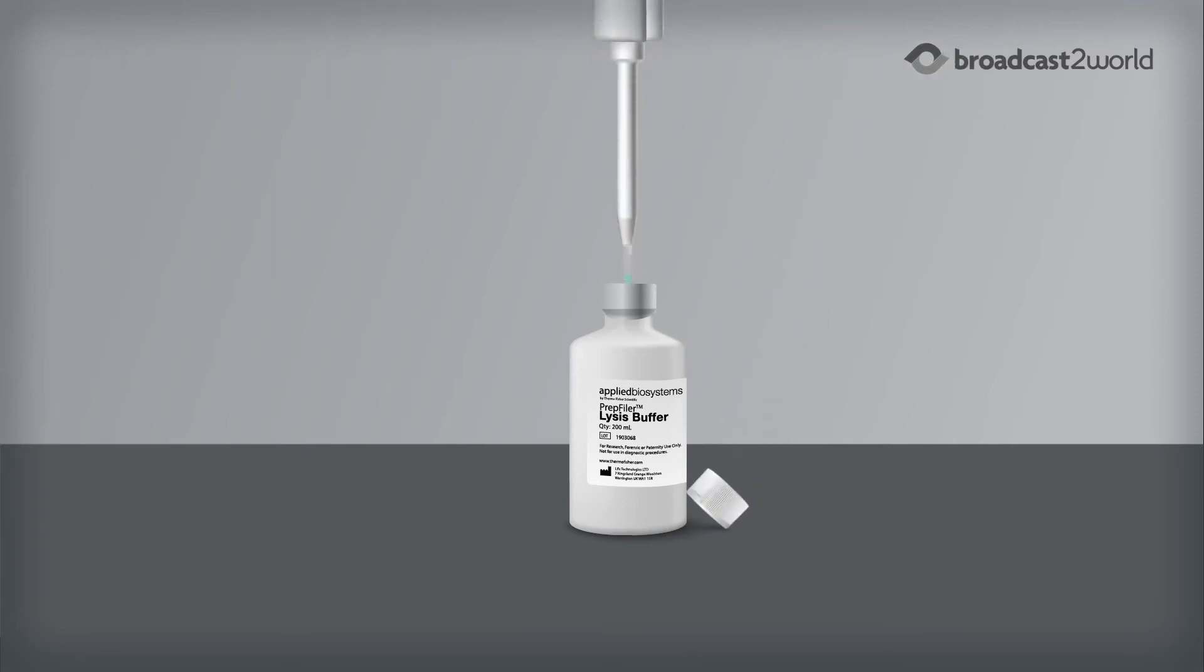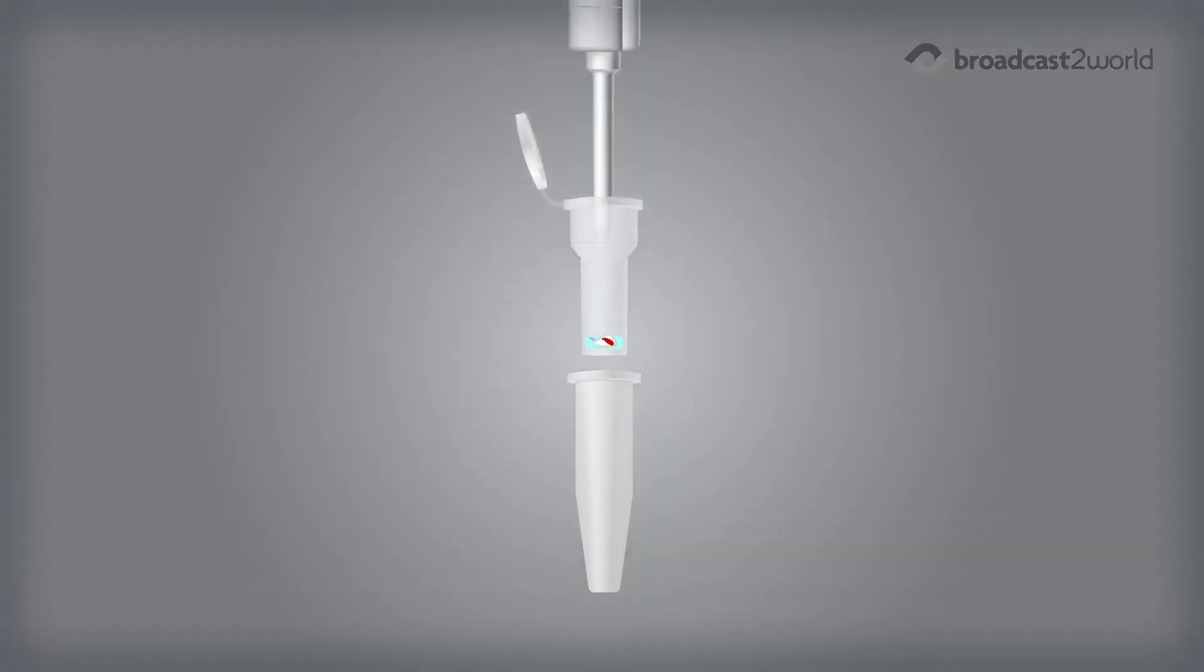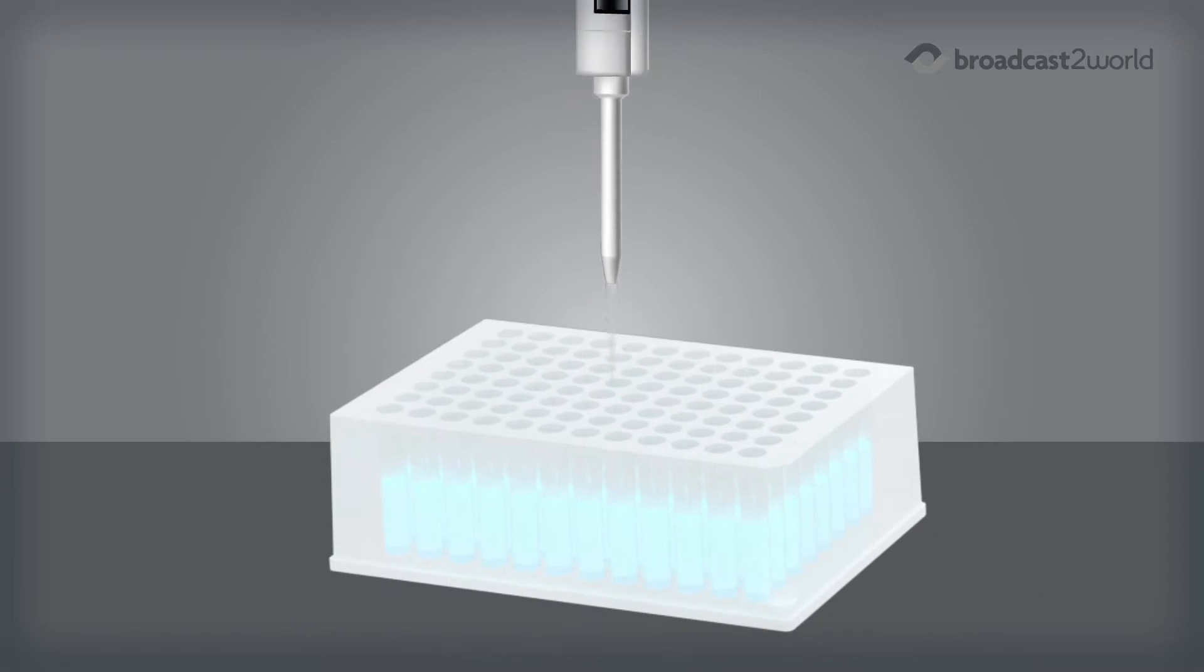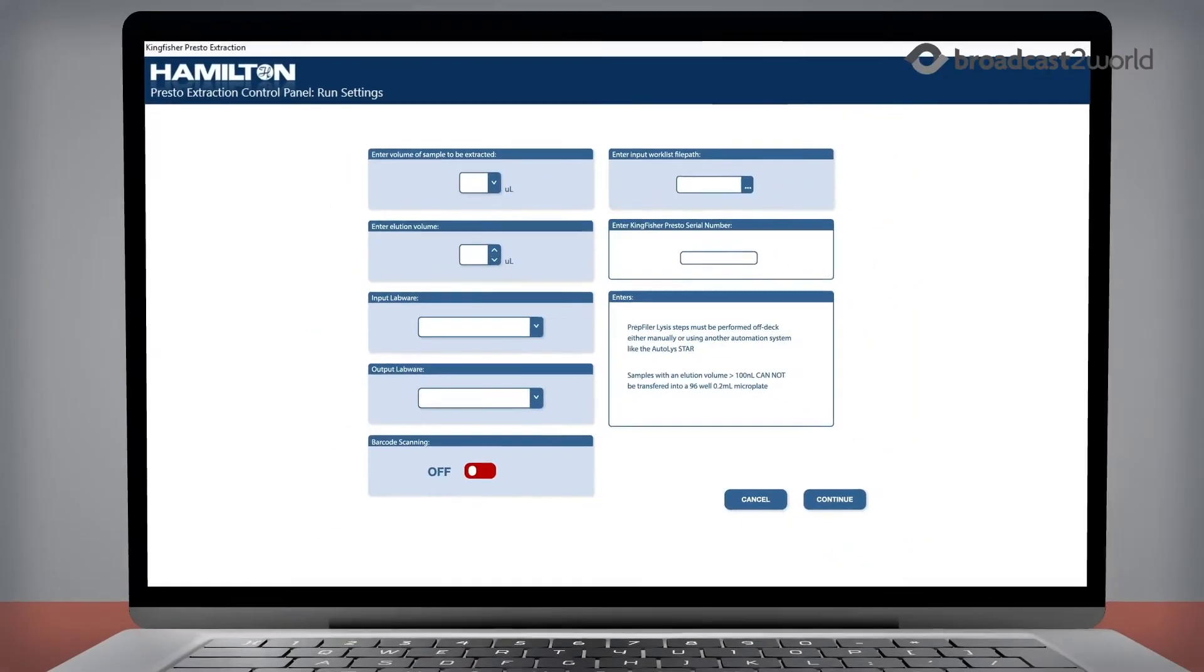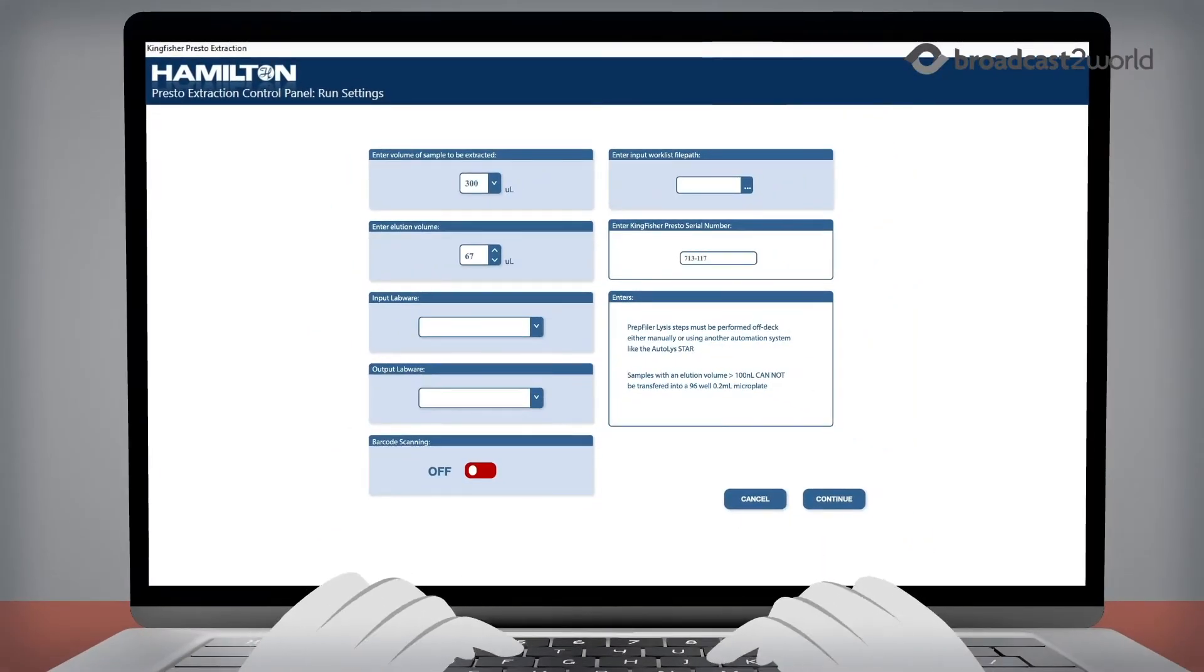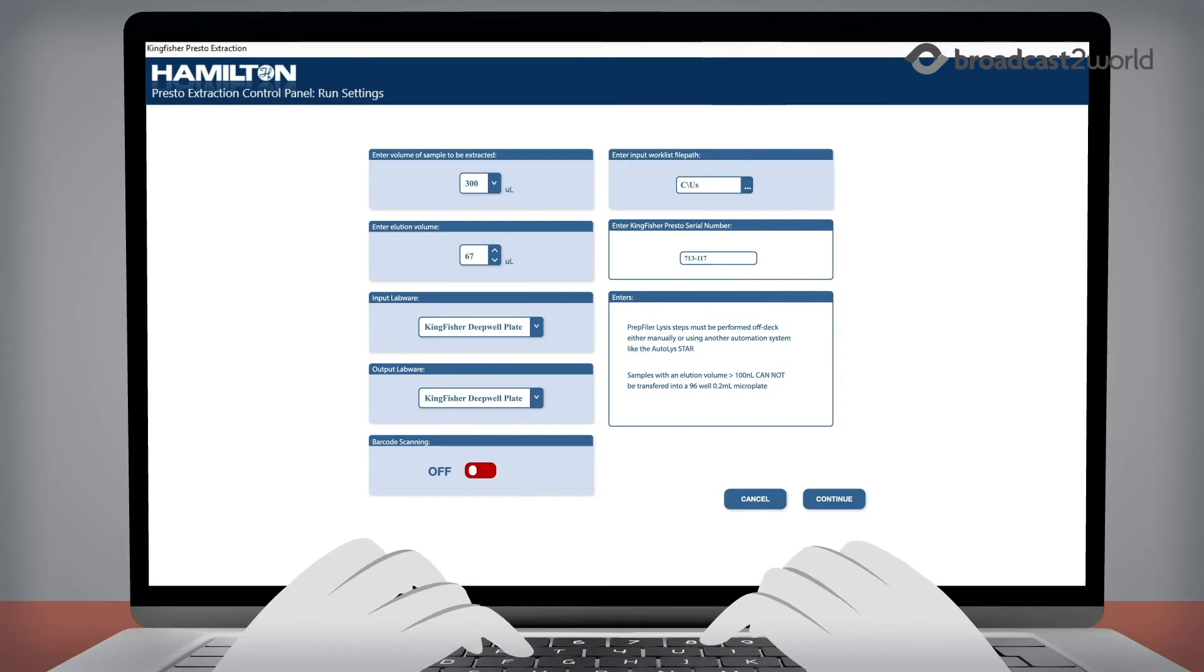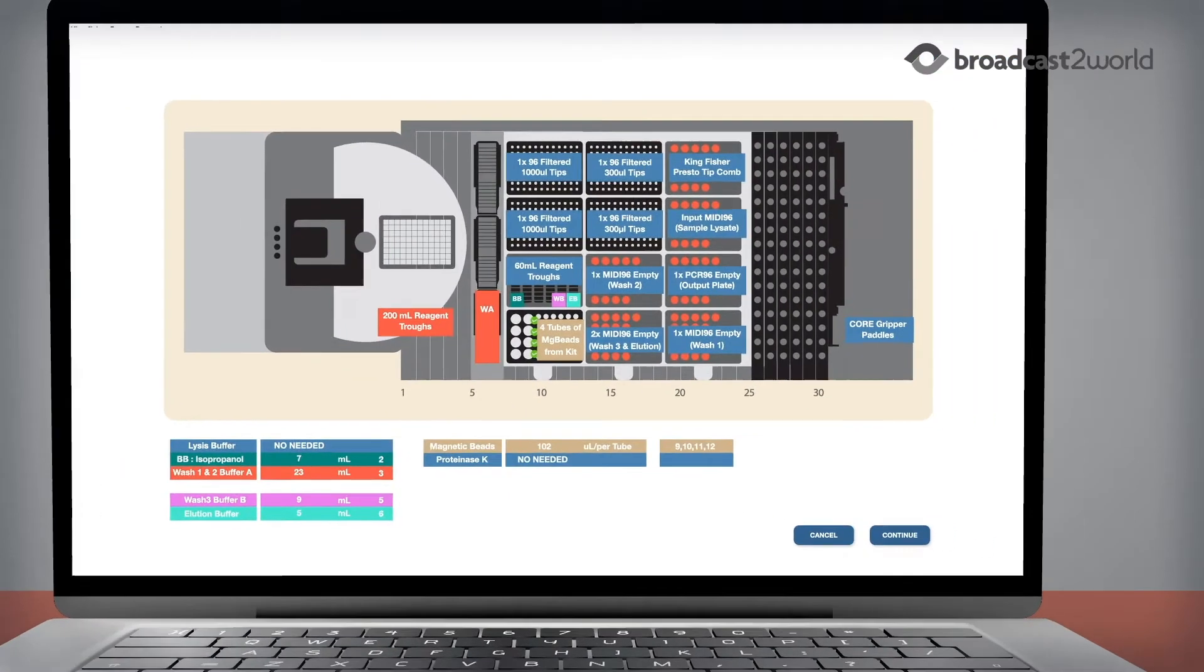The workflow is simple. After lysis, samples are loaded onto the ID Nimbus Presto System. Tubes or a plate can be loaded onto the system. The software walks the analyst through defining the number of samples to be run, input-output, and where to load specific reagents.